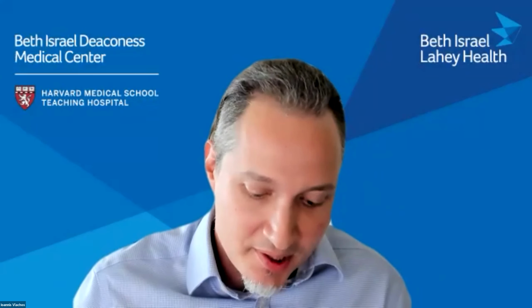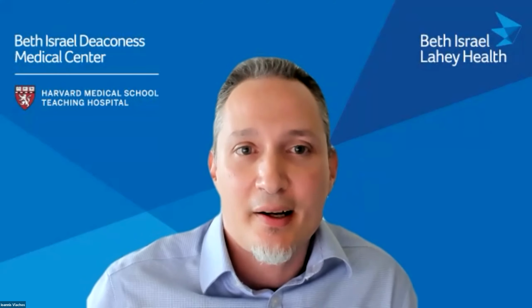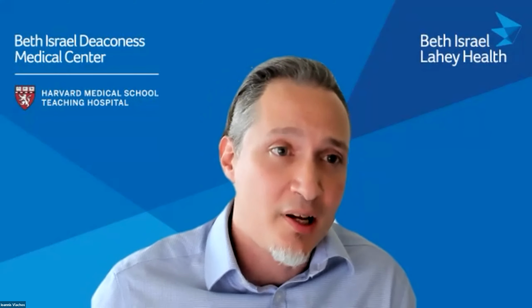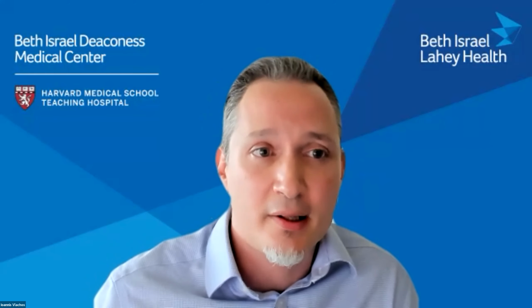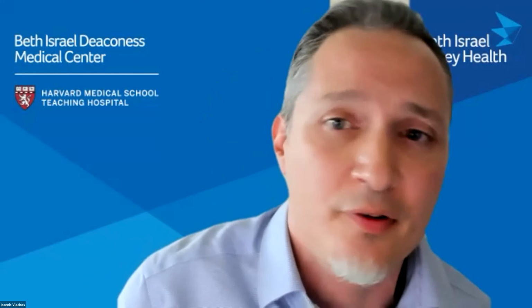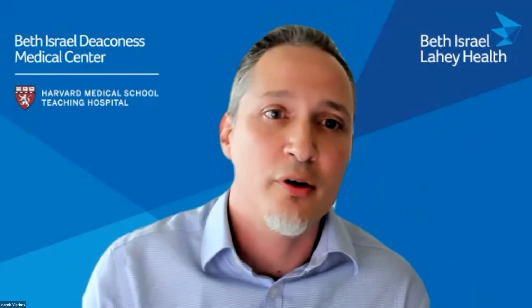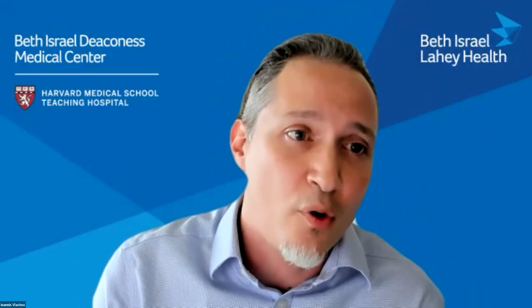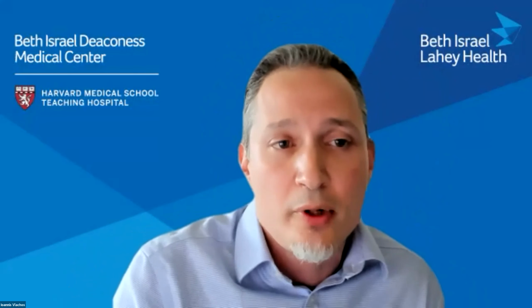And we have one question from Bjorn. Do you yourself, or do your pathologists, select regions of interest? Yeah, so this is the question I was expecting, and I think domain expertise can help for assays like this. But even if you do Visium, or even if you do something hypothesis-free, to make sense of what you got, you need domain expertise.